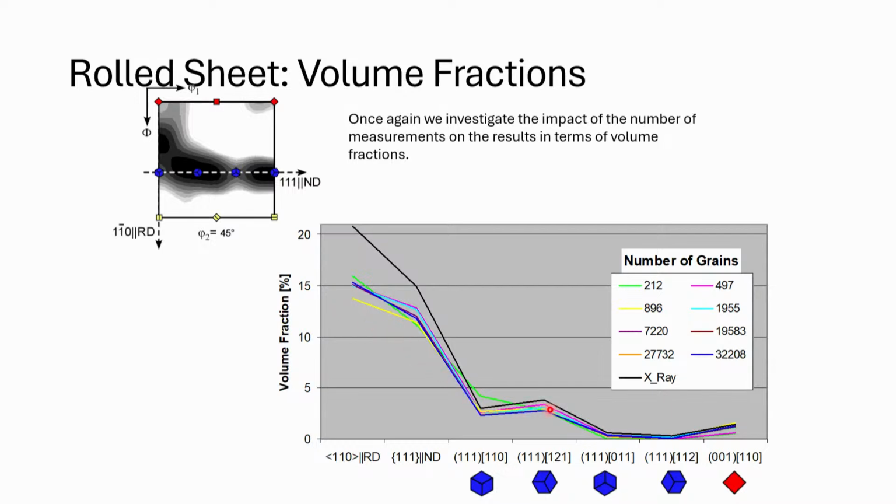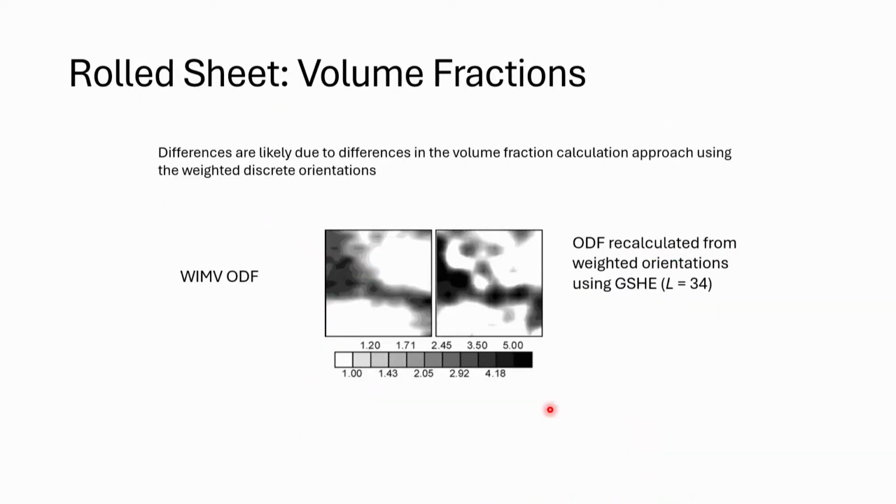So a lot of people ask, should I use X-ray? Should I use EBSD? It's just kind of a trade-off of what exact information you're getting, right? You can make them so they look pretty reasonable. And then this is just different ways to calculate the function.